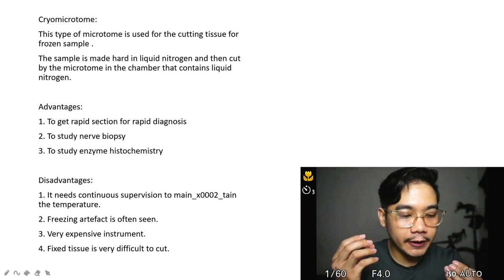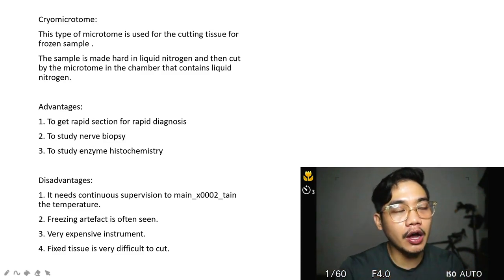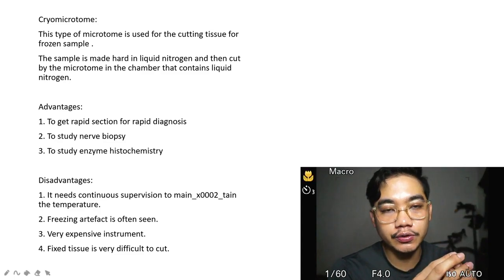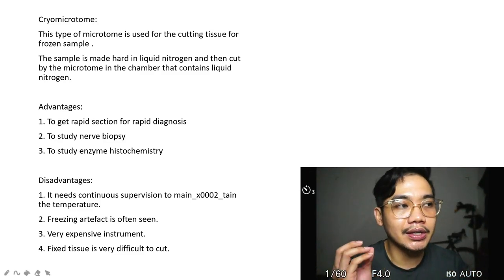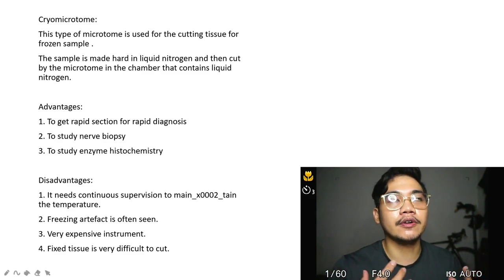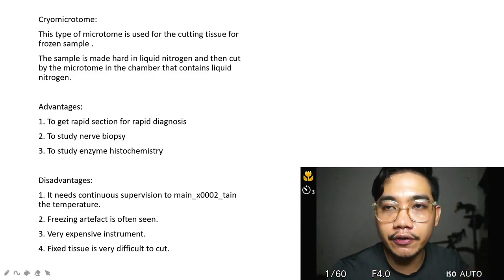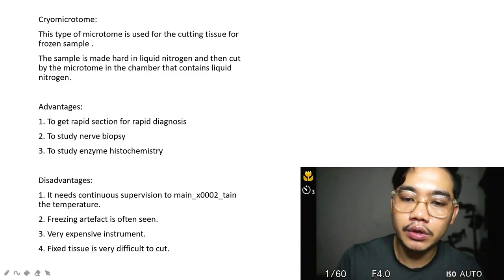That's why the time from removal of the specimen to the histopathology section for frozen section is very crucial, because of ongoing metabolism in the tissue, meaning some tissues are already undergoing apoptosis or autolysis. That's why it needs to be rapidly transported to the histopathology section. Once it is frozen, of course, the metabolism is retarded. So it really needs to be fast. If it has formalin or any fixative prior to the frozen section, it's really hard for it to stick to the freezing media.